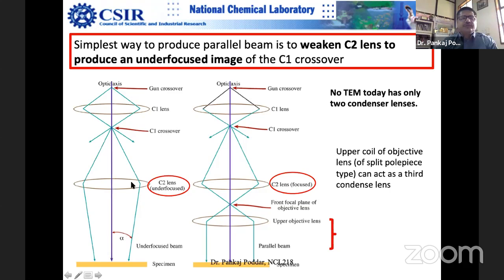You don't need to use it, because you can just use the C2 lens to serve the same purpose. If you switch it off, then this lens is quite far, and the magnetic field from this lens will be very weak on your magnetic samples. So it's not very likely that magnetic nanoparticles or something will fly towards this. It is quite likely that your upper objective lens can get damaged if it is turned on. So I hope you got the solution.